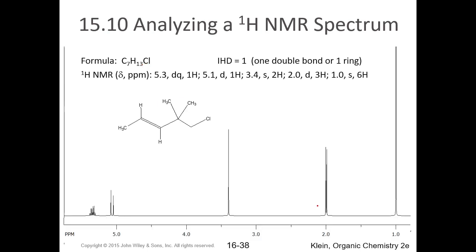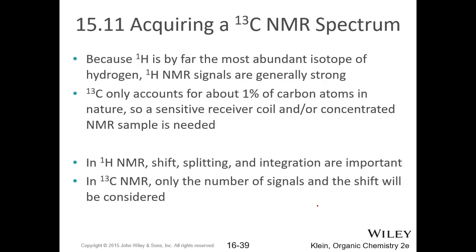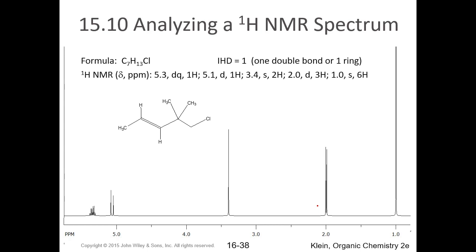Okay. So the reason I think they gave the data line is the fact that this is a peak that's not easily discernible as a doublet of quartets. All right. Any questions? All right. It's a lot there, a lot to digest.